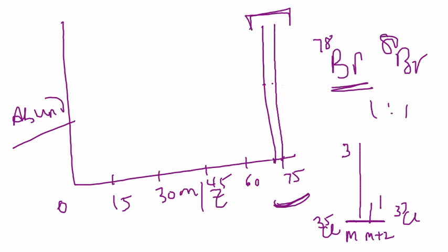But the net idea ultimately is that mass spec is used to determine the molecular mass of a certain compound. So if you're given, let's say, 2 isomers, mass spec is probably not the best method to distinguish them just on the basis of the molecular ion peak, unless there are differences within the structure that will change the fragmentation pattern.